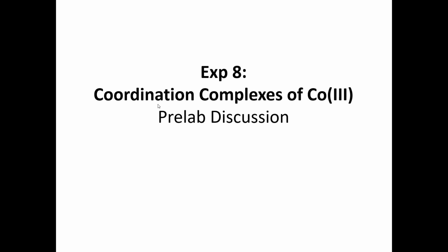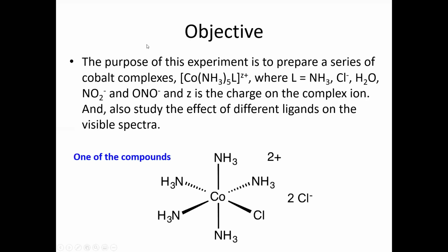Experiment 8, coordination complexes of cobalt-3. The purpose of this experiment is to prepare a series of cobalt complexes. So we learned the complex ions in class, right?